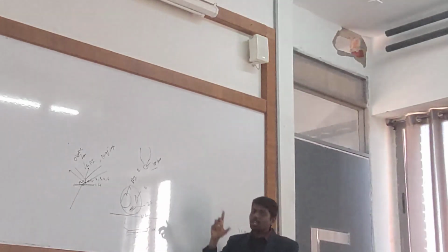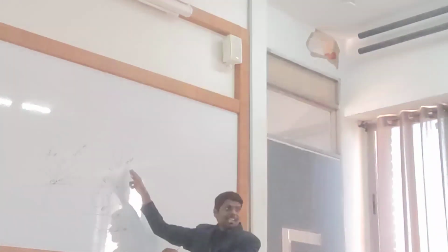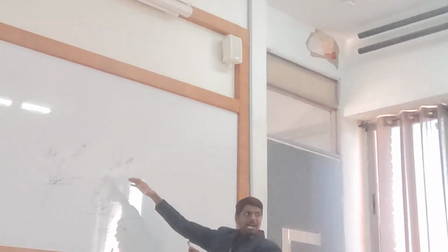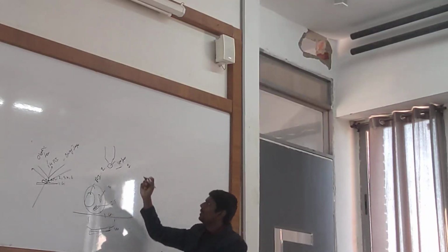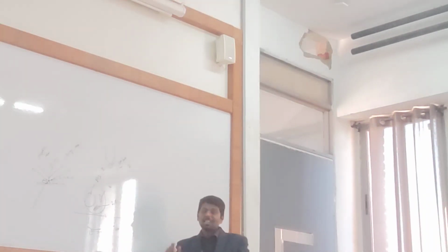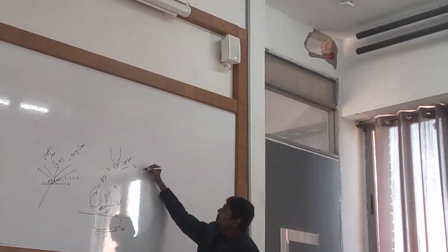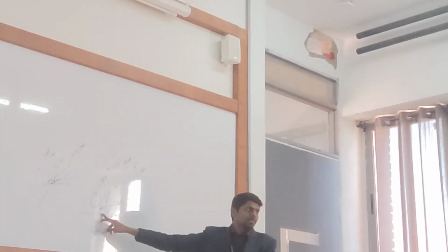Here what I am trying to do is adjust the objective lens RI to the designated RI. Now I will change the RI of my objective lens. Maybe I will keep the RI at 2. Now I will see the nucleus of the cell. Now the nucleus will be prominent in my microscope. But again, if I change the objective lens RI to 2.5, then suddenly mitochondria will appear in the specimen.